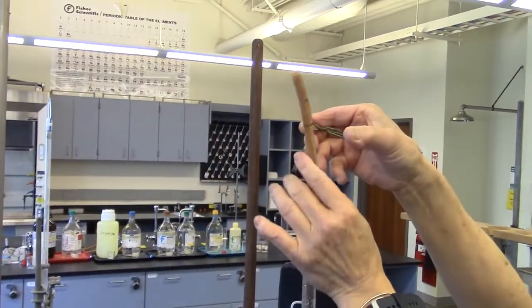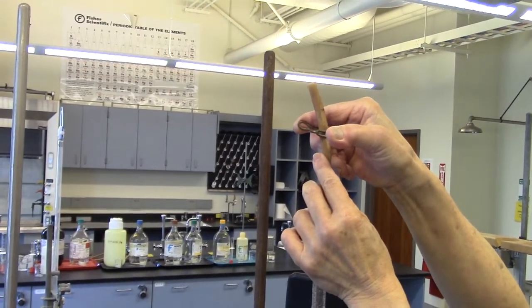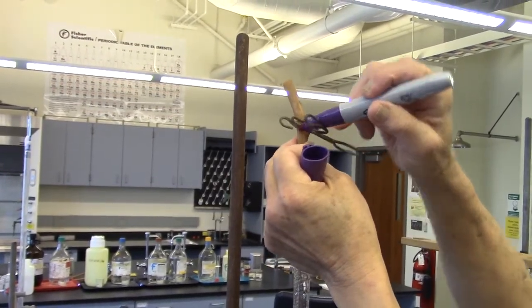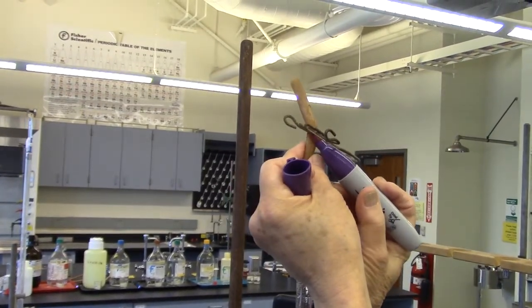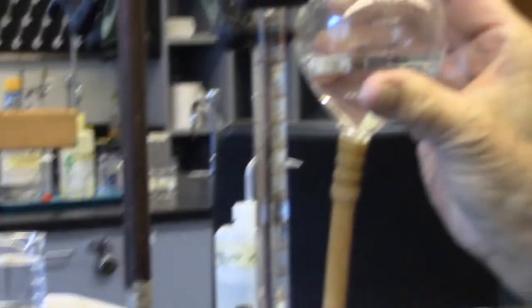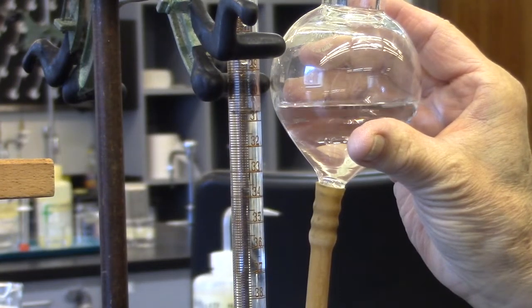Using the pinch clamp, clamp off the tubing at the top and mark the clamp's position. Now the first measurement is ready to be taken. Take the leveling bulb and line it up with the water level in the manometer. Record the volume reading from the manometer.